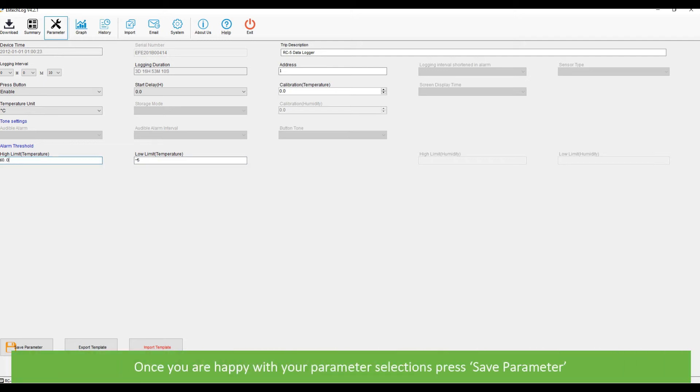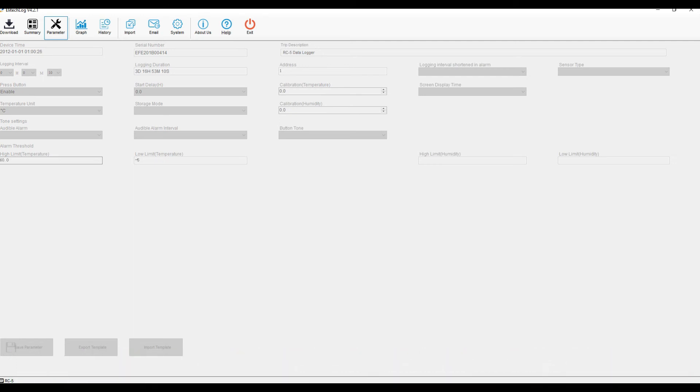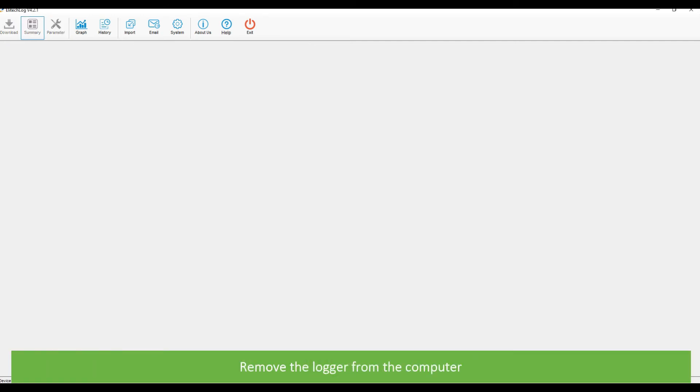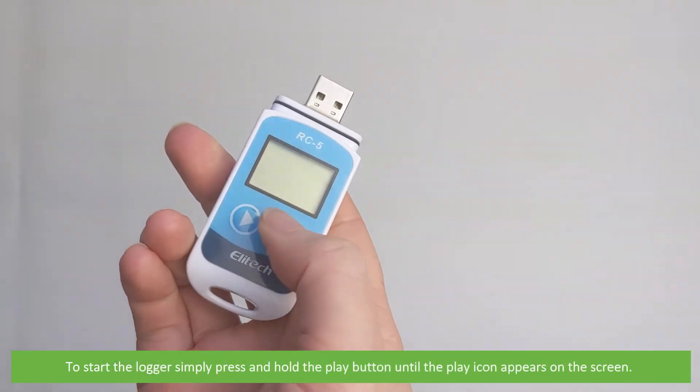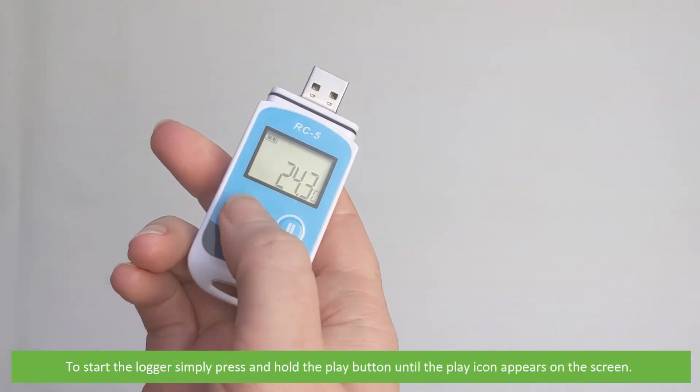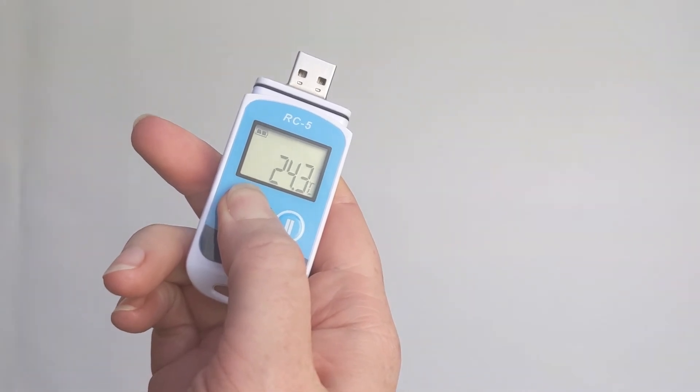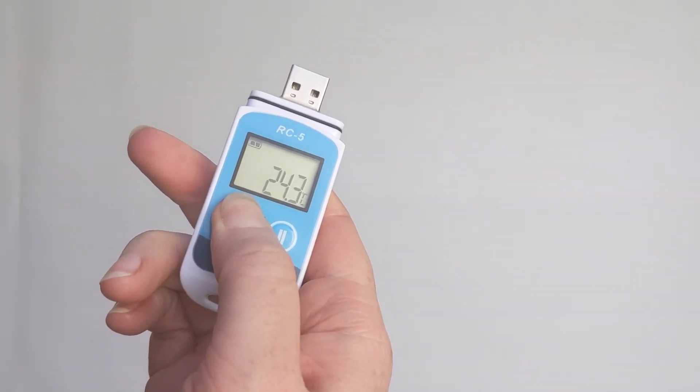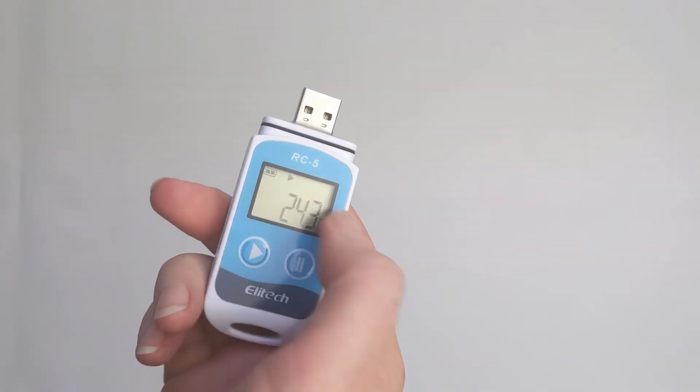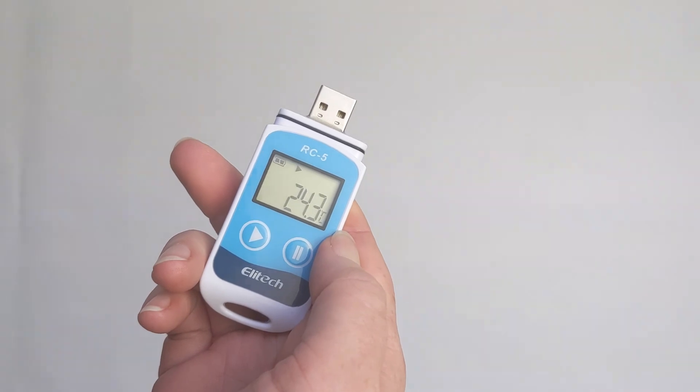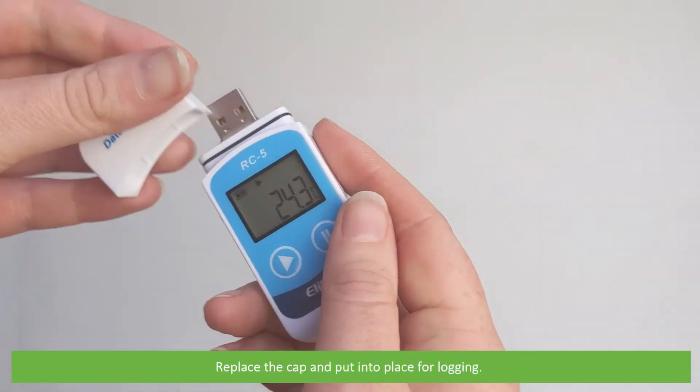Once you are happy with your parameter selections, press save parameter. Remove the logger from the computer. To start the logger, simply press and hold the play button until the play icon appears on the screen. Replace the cap and put into place for logging.